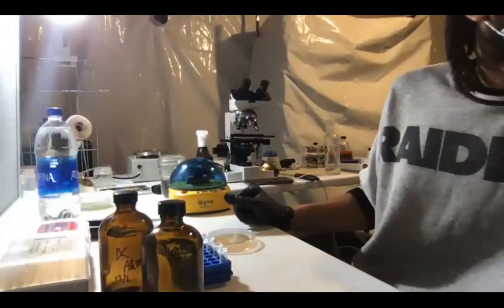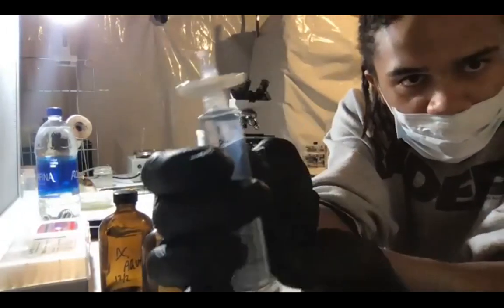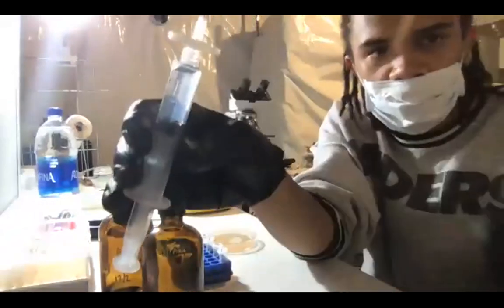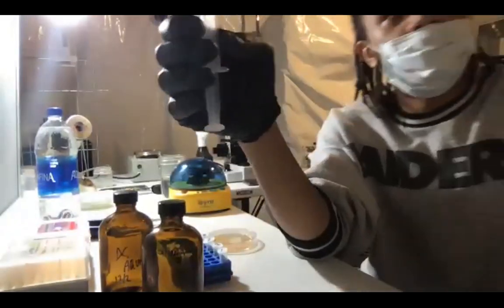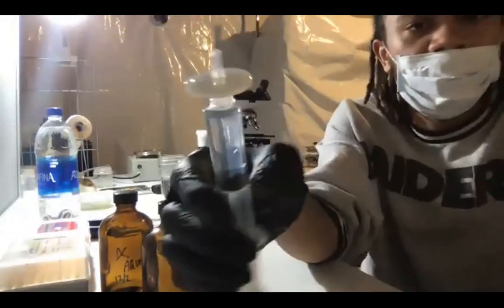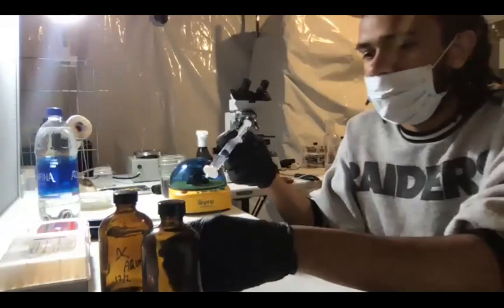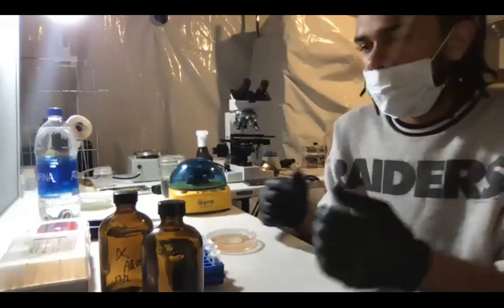Also, you're gonna wanna order these syringe filters that you can see here. For some things that are more sensitive, you're gonna wanna make sure you filter sterilize the water. So I'll get like a 60 milliliter syringe and fill it up with water and put a syringe filter on the end of it. And then I'll use this and squirt it into my different tubes and my mixes and things like that.